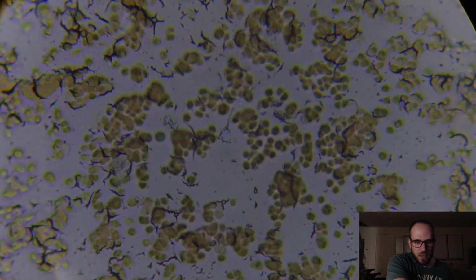Yeah. So when you look at blood under a microscope, it actually loses its color. Well, it will not look red. However, there's a way to make it red. Among my filters, of which there are plenty that I paid for, and it was a wise investment, should be one that is just all red. So we got ones like this that will obliquely illuminate it red. You can see if I put it in front of my face. But I know I have one that's fully red. They had to have given me one such. Just gotta find it. There ought to be a better way for me to organize these as well.